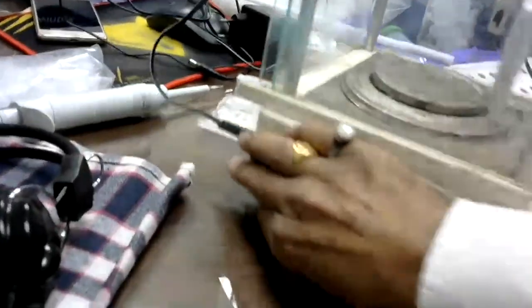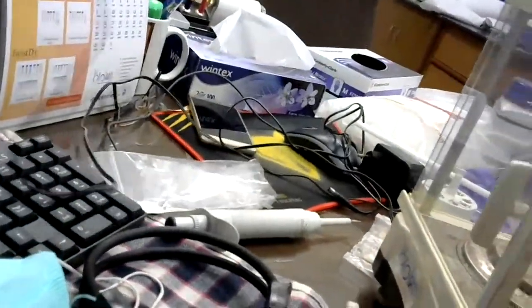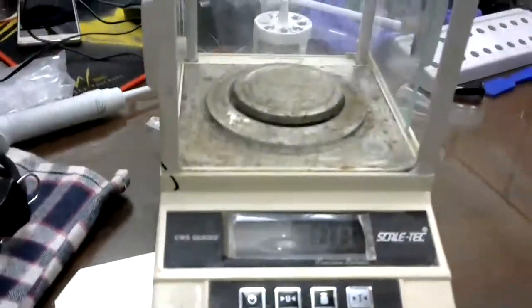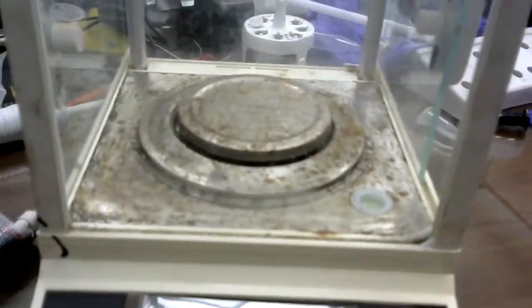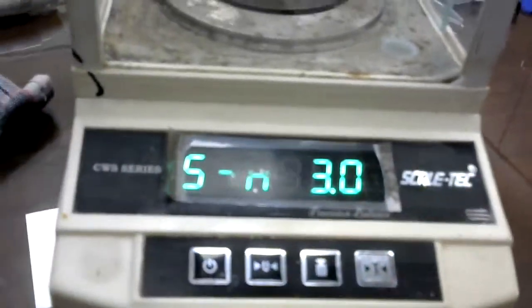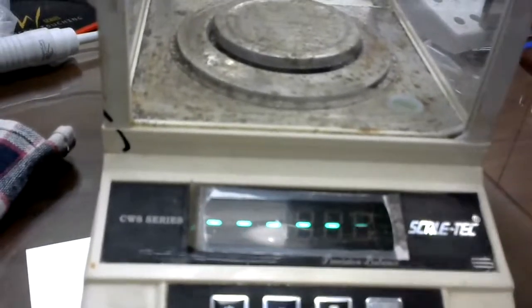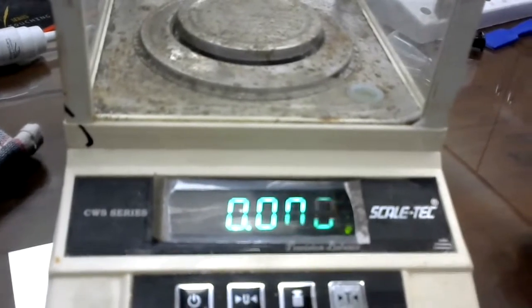So now you can see whenever we want to measure something, we need a balance, for weighing. This is the balance, and now it is switched on.